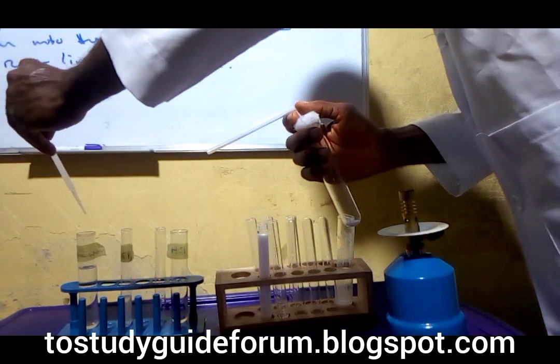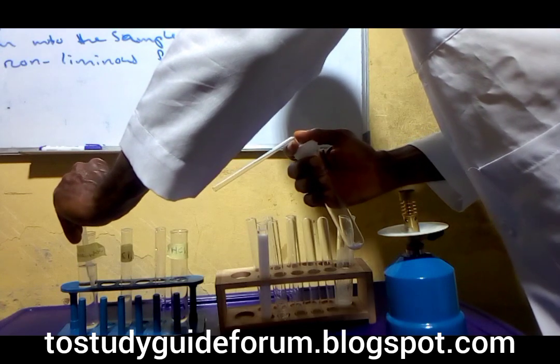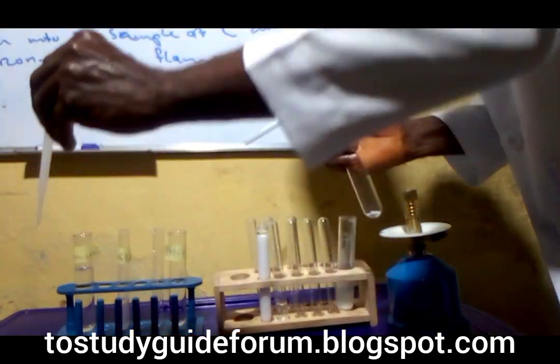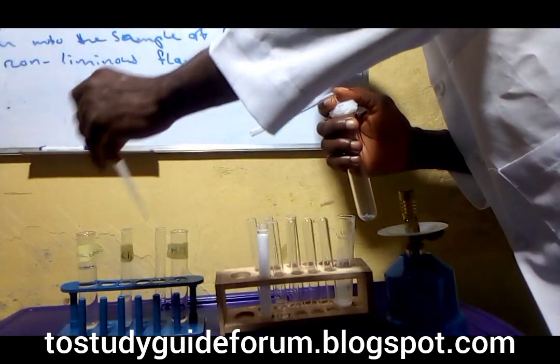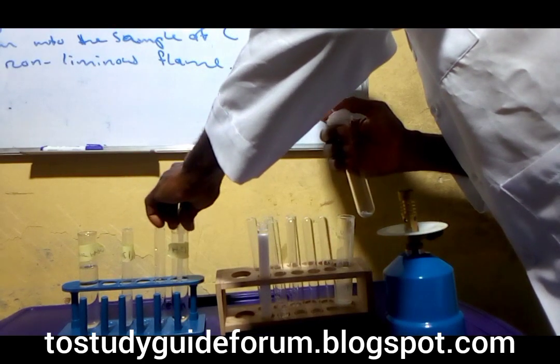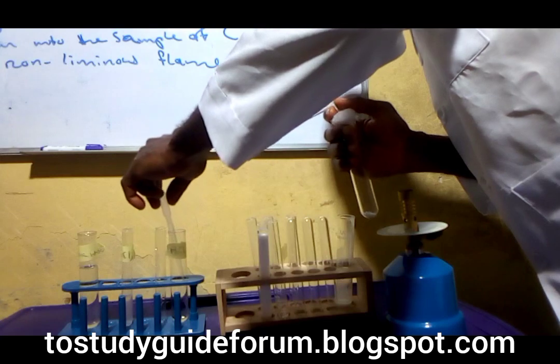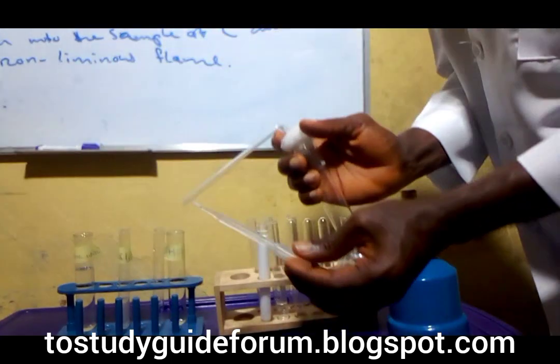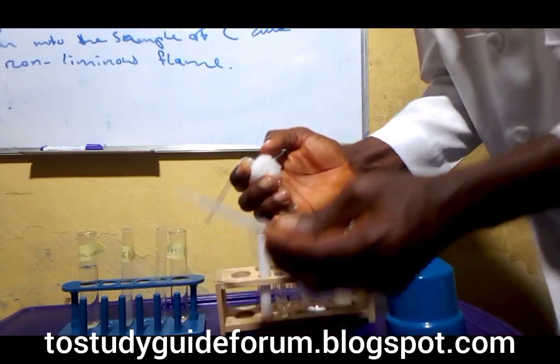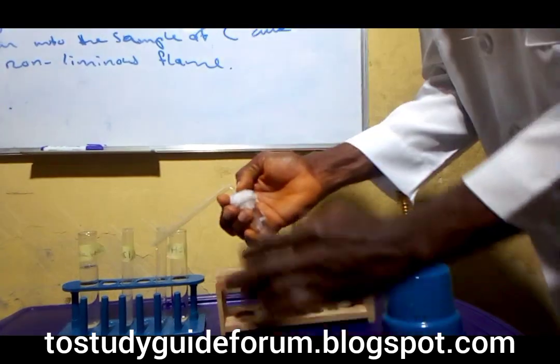Get hydrochloric acid, and we add it into the sample, then we bubble into lime water.